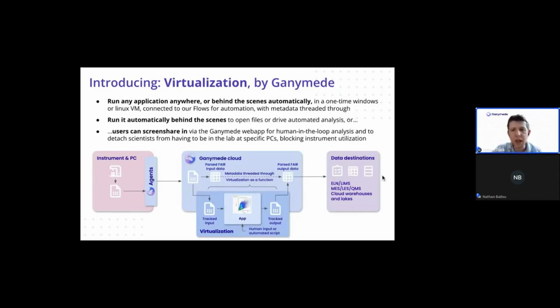And this allows us to treat that human-in-the-loop analysis step as just a function. We can thread metadata through, we can understand the A to B of saying, okay, the input data, the output data, we can link those together because we know exactly what was run in this virtualized environment. So now finally, these programs are also fully automated as a part of the process, completing the entire loop of automating your lab or your facility.